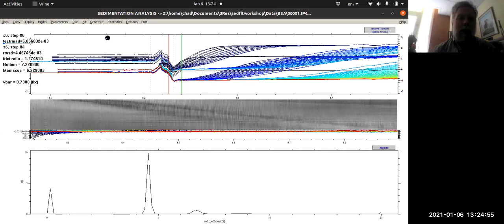We've really only started exploring one particular model. And in this particular model, we've kind of already made some assumptions about things, partly because I know what's in this sample. It's just BSA, it's fairly purified. I bought it from the store. I ran it on the gel. It looks really nice. So my interpretation is that this main peak is probably mostly my protein, BSA.